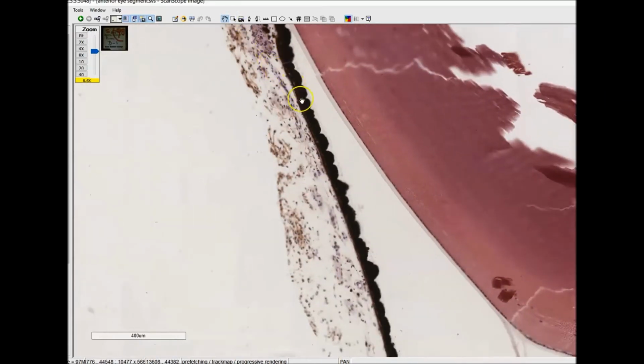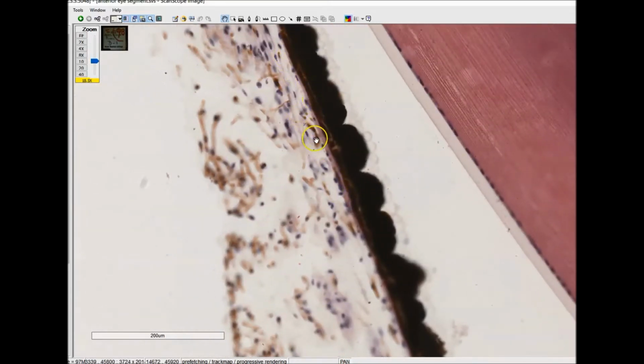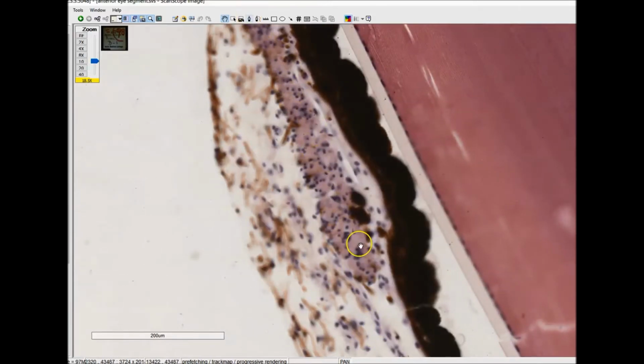How does the pupil open? Well, there are radially aligned bands of smooth muscle that are associated with the second epithelial layer right here. And you see this kind of pinkish layer? These are myoepithelial cells right here. And when these contract outward, it pulls the pupil back open. So this is the dilator, and this is the constrictor.